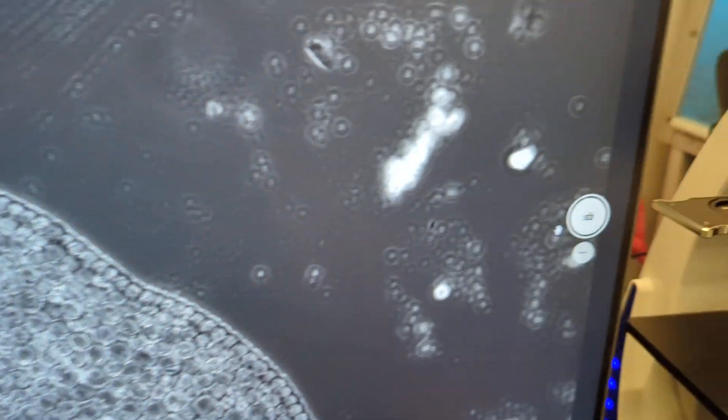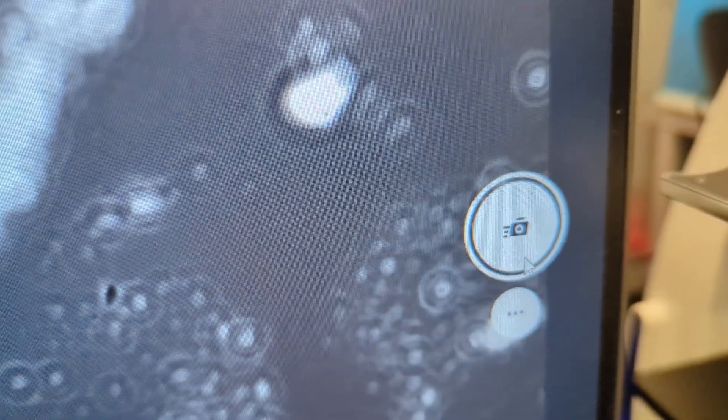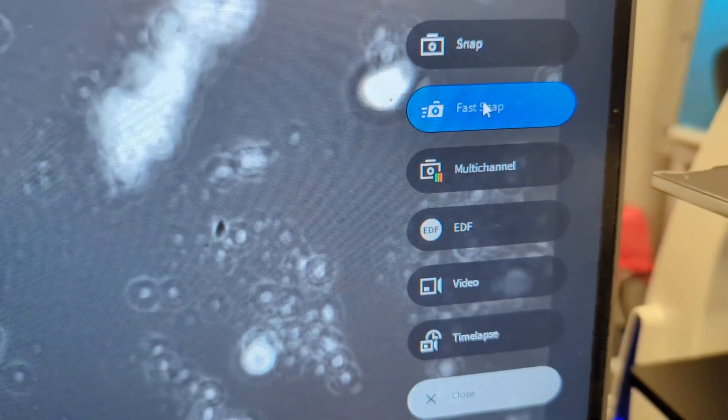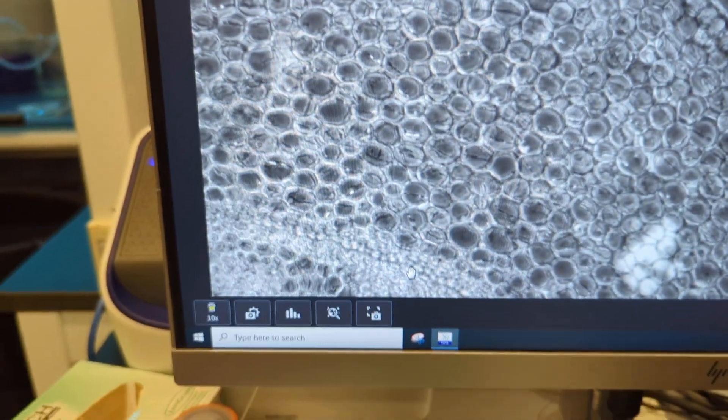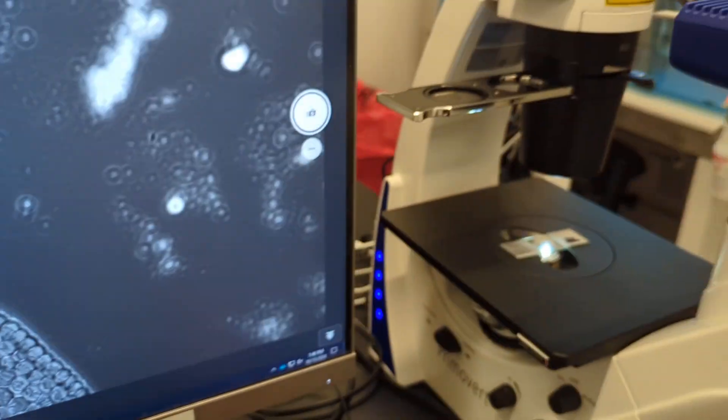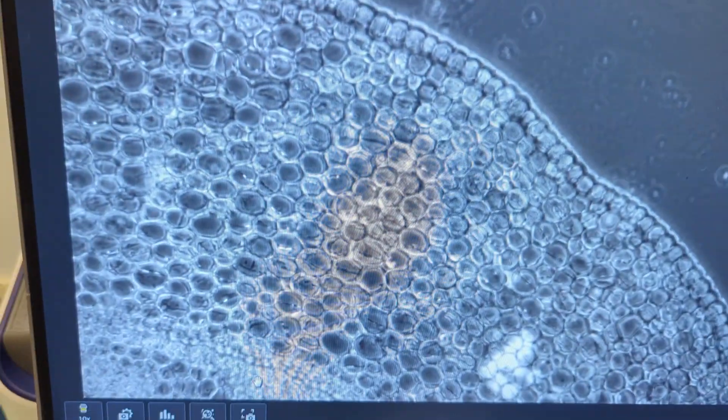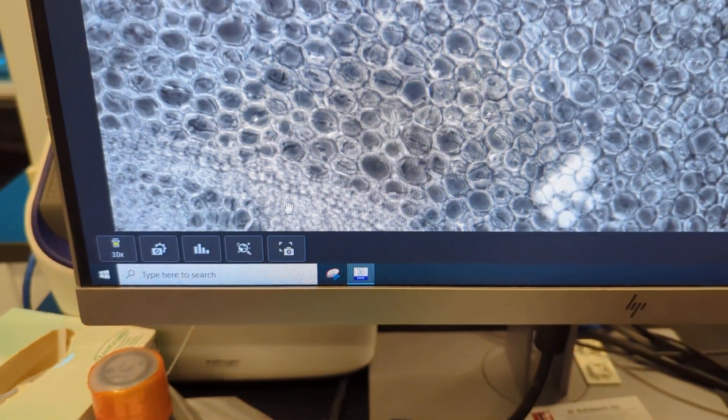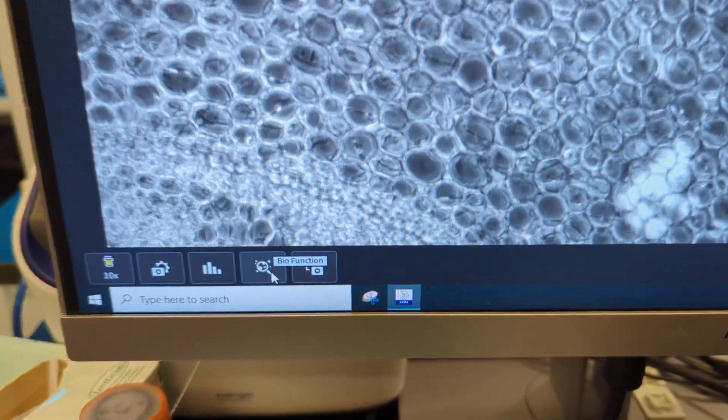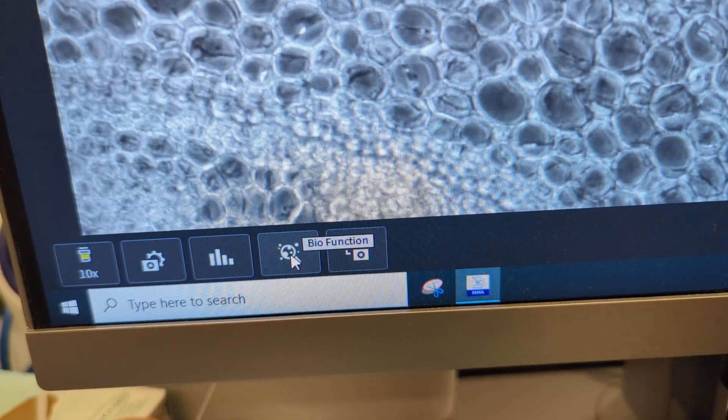We're in the fast snap mode, as you can see from here. So fast snap icon, and I just have it in bright field right now on the scope. So down at the bottom here, your count icon is this.